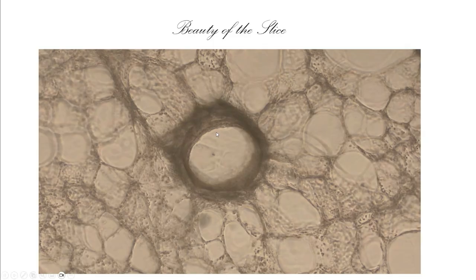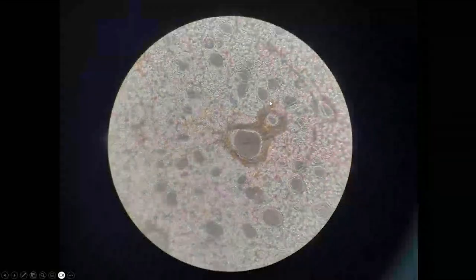The epithelium is here along this interior. There's not much epithelium there relative to the mass of the slice, but the smooth muscle rings are substantial. And this is under 10x microscopy. So that's basically what composes the slice.